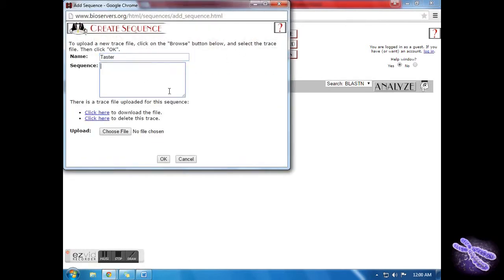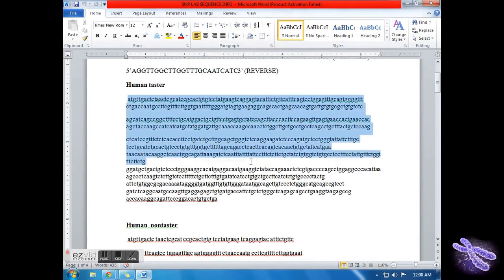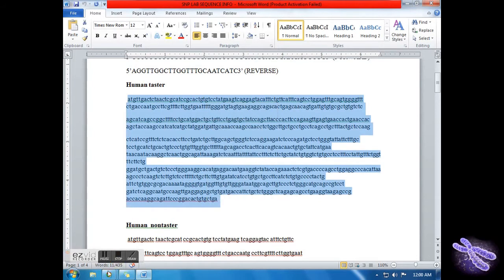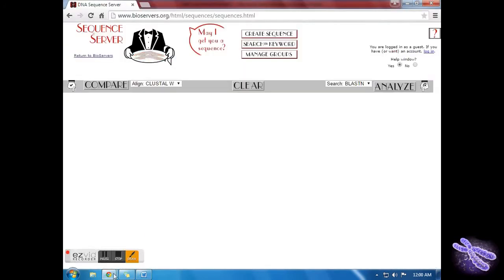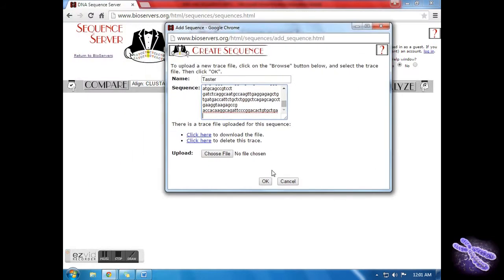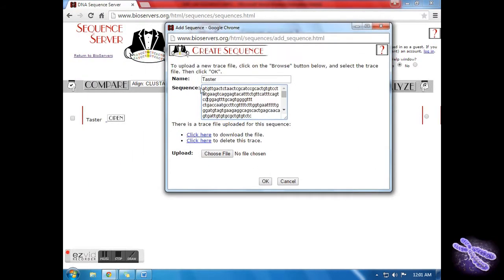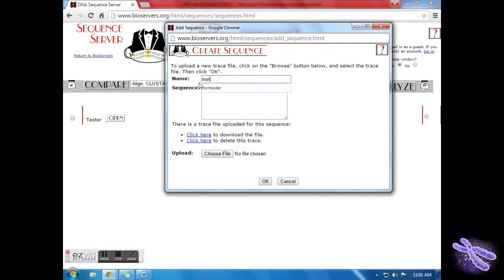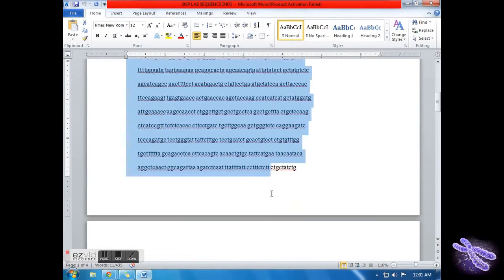Make the first sequence by typing TASTER in the name box. Then go to the document where you've saved your sequences. Copy and paste the entire sequence for TASTER into the sequence box. Remember, bases only. Click OK and the sequence will be created. Clear the fields, put non-taster in the name box and the corresponding sequence in the sequence box. Once again, click OK to create the sequence.